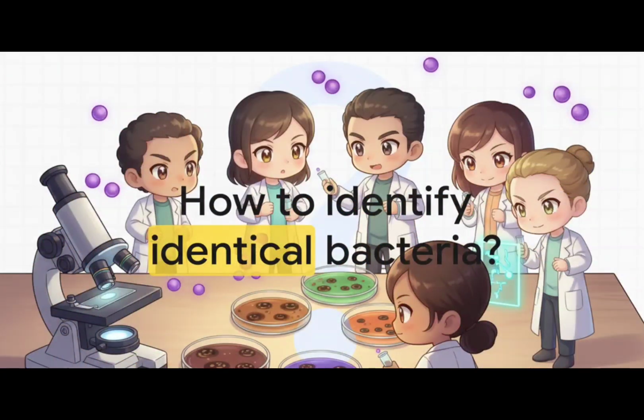Imagine you're peering through a microscope at a clinical sample. You spot gram-positive cocci in chains. Sounds simple enough, right? Well, here's the kicker. Visually, they all look incredibly similar. We've got a microscopic identity crisis on our hands.